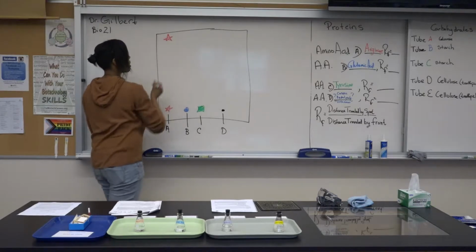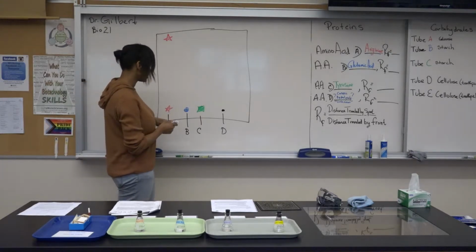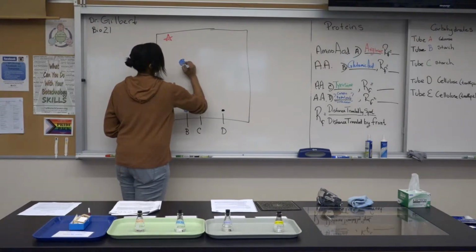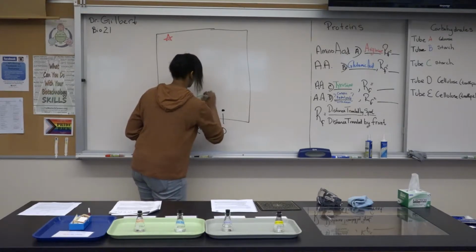So I'll put a star here at the end of our experiment. Something that was middle in size would maybe be like here by the end of our experiment time. And then we'll say that C is really a larger molecule, larger amino acid.